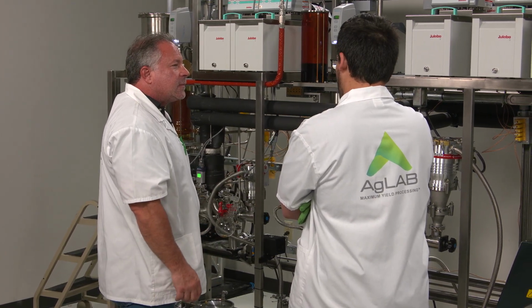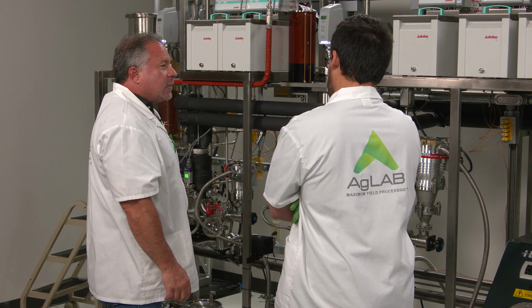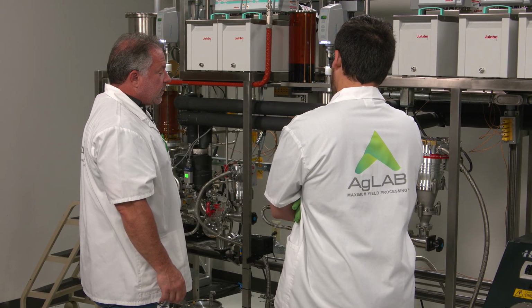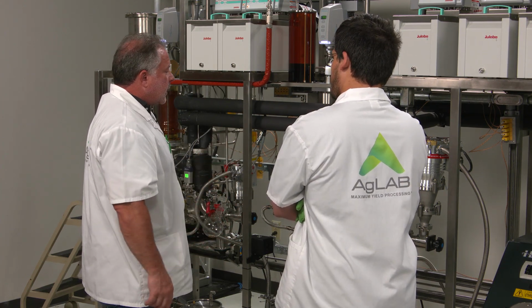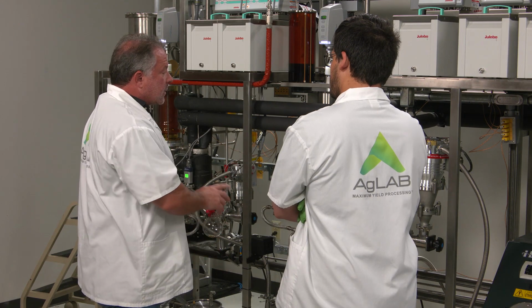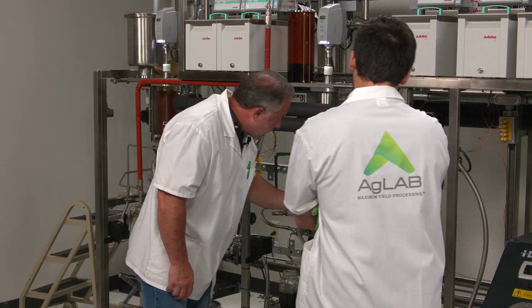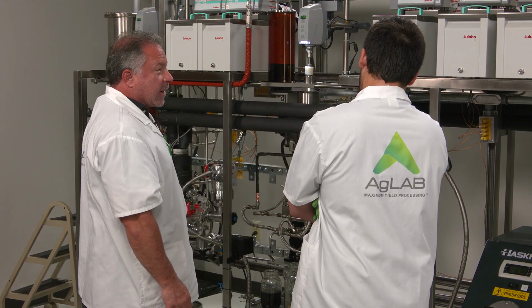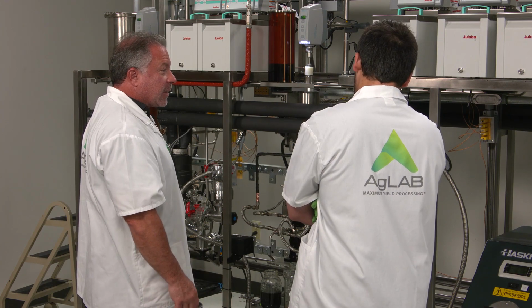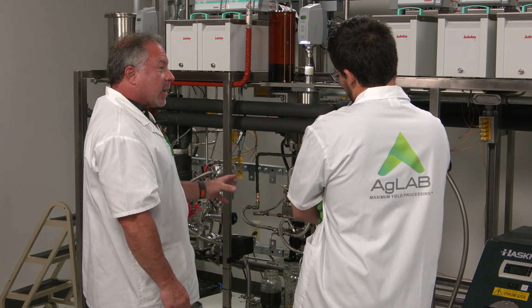Yeah, under that vacuum though, I guess you'd have to catch your terpenes with a cold trap mostly. So people who do a strip in that way to do a single stage, in the way that it's done here, you have such a better vacuum. We're down at 0.004 Torr right now, which is a really good vacuum. That creates a better product.